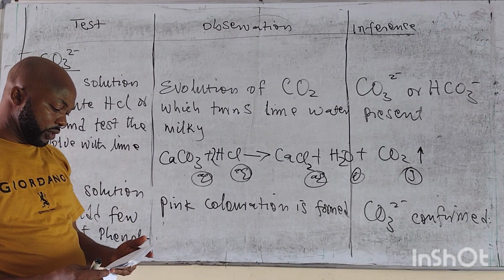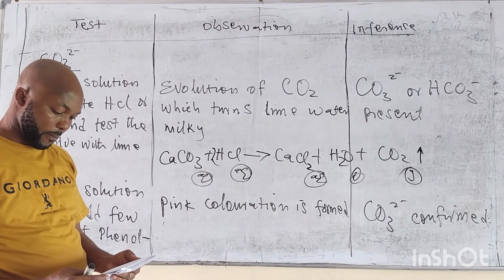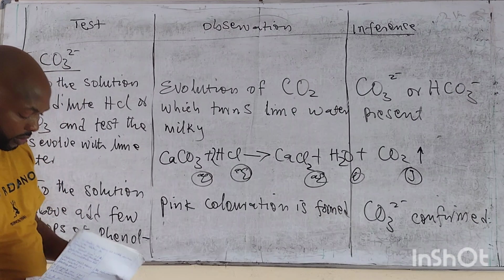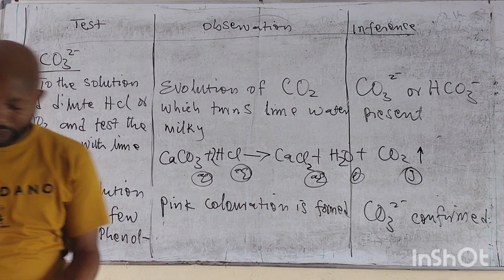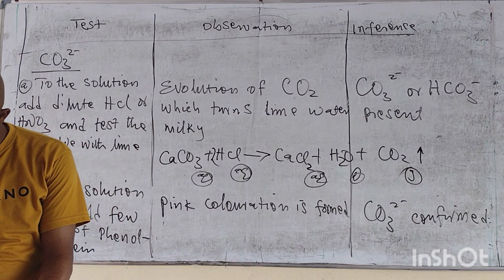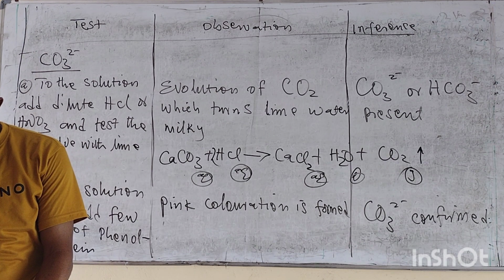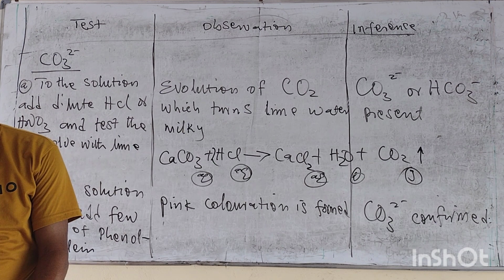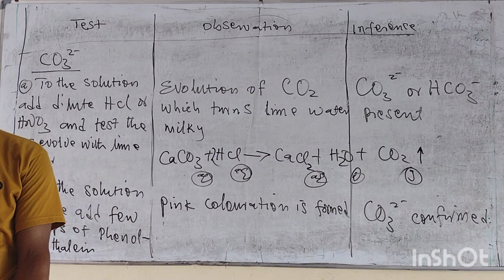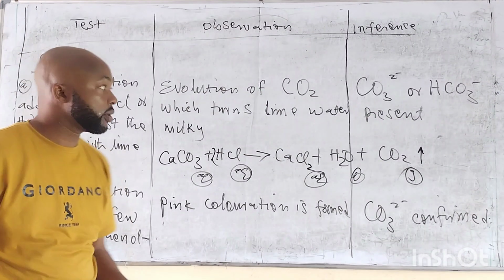Which one again do we deal with here? Let me see. We've dealt with SO3, SO4, NO3. Okay, that's not bad. Cl-. Okay, let's deal with S2-.